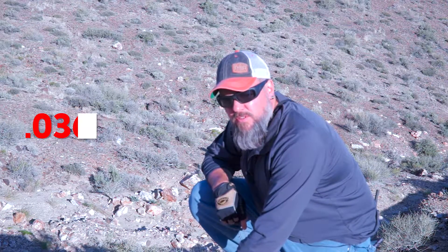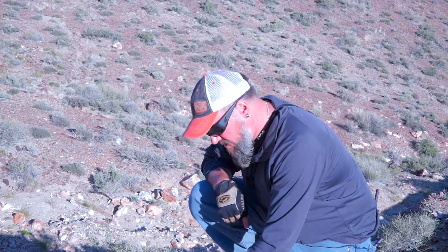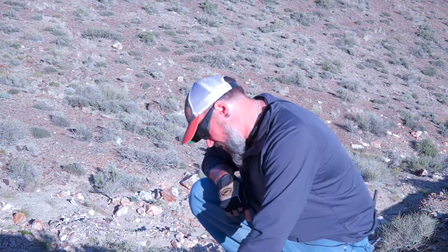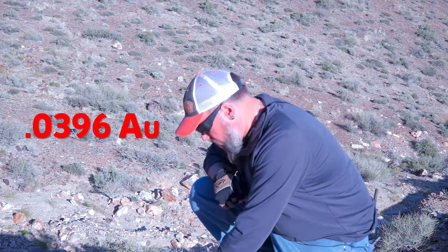That's like .0367 AG. Do you know what that means? Whoa! That's awesome! I don't know what it means either, but I think it's awesome. Hold on. Whoa! That's like .0396 AU! Whoa!